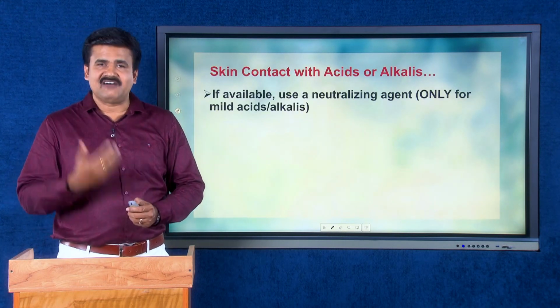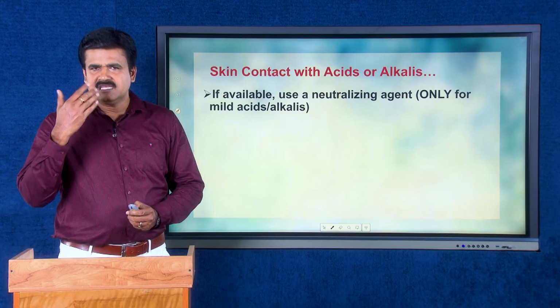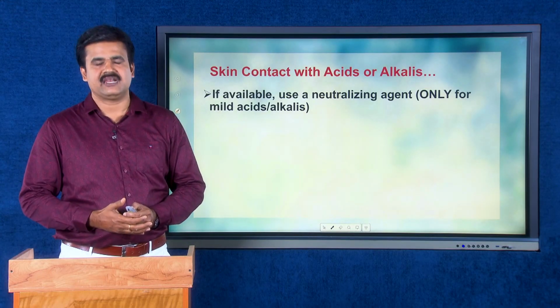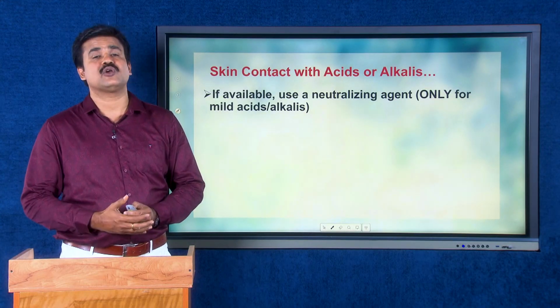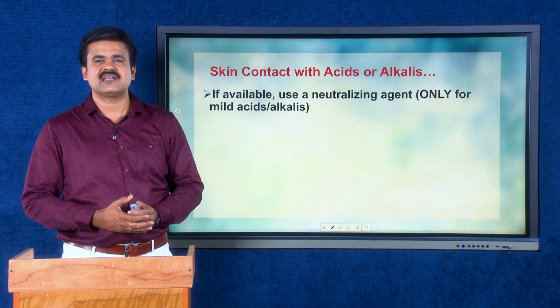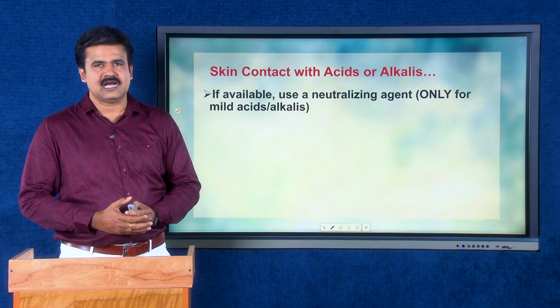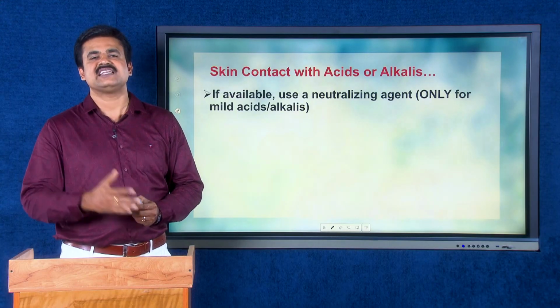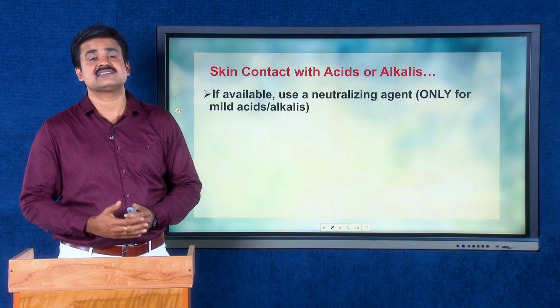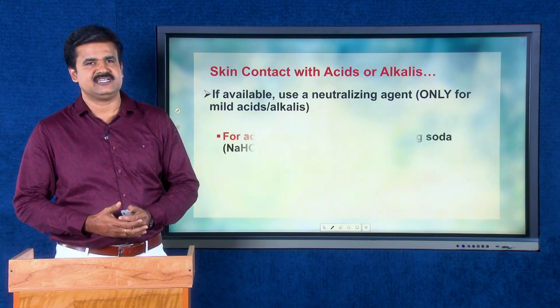Now, if available, use neutralizing agents. If your skin is in contact with mild acids or alkalis, then you can use some neutralizing agent. It should be noted that this neutralizing agent is applicable if and only if your skin is contaminated with mild acids. In the case of strong acids and alkalis, a neutralizing agent is not at all recommended.